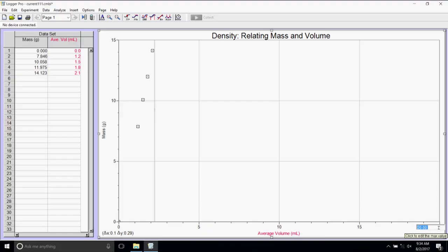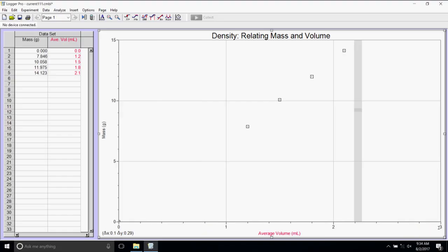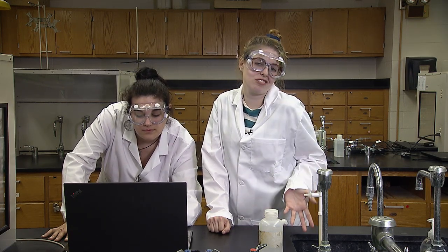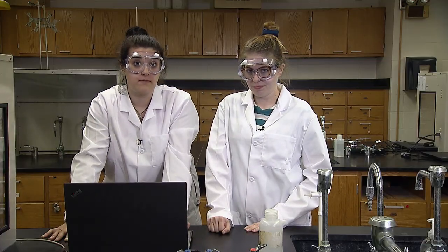This graph is used to get your density. Compare it to the densities from Table 2 in Lab Manual to figure out the identity of an unknown metal sample. If your value is between 2 metals, pick the one that's closest. For more general information about lab, watch the first day of lab video. And remember to take the pre-lab quiz.